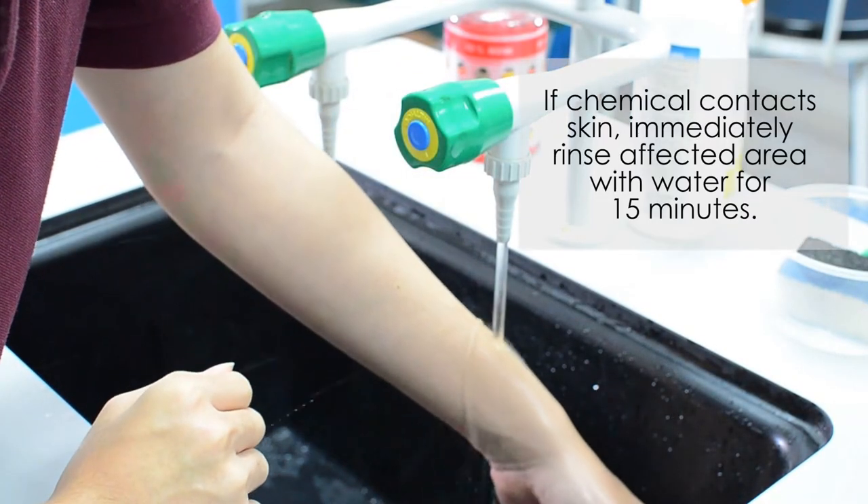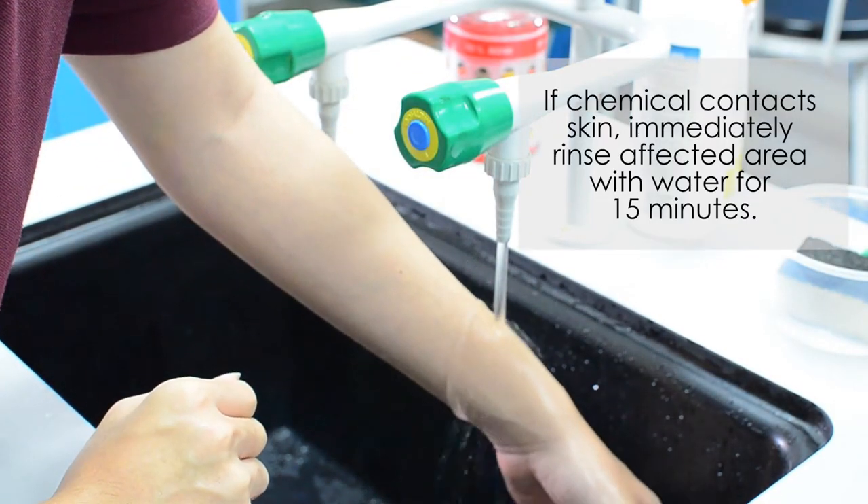If you have spilled any chemical on the table, immediately use a paper towel or a damp cloth to clean it up. If your skin comes into contact with a chemical, immediately rinse it with water for 15 minutes.